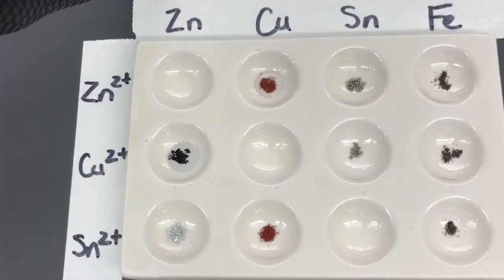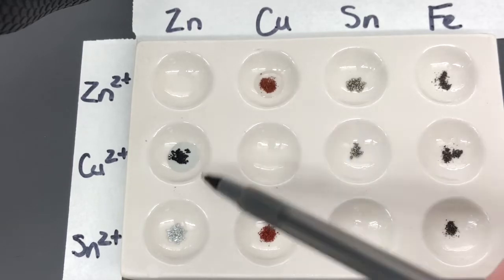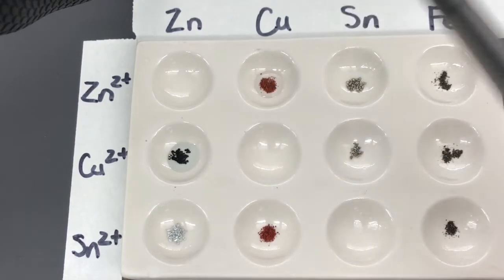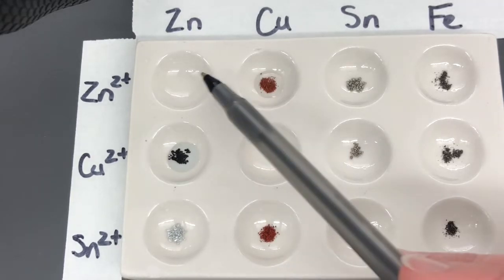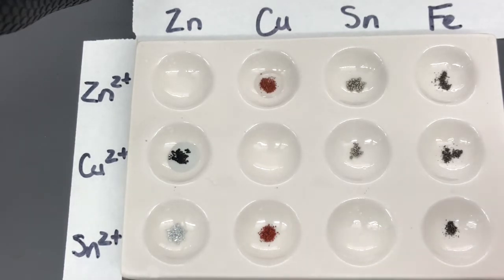In part 2, we're going to do what we did in part 1, but expand it to look at 4 different metals and 6 different cations. I've got the first 3 cations set up with their respective metals. So we have left over from part 1, the copper mixed with zinc 2+, where we did not observe a reaction, versus zinc with copper 2+, where we did observe a reaction. So in the rest of these wells, I have zinc when we want to react it with tin, copper to react with tin. I've left these 3 wells empty because they would just be mixing the metal with its own cation.